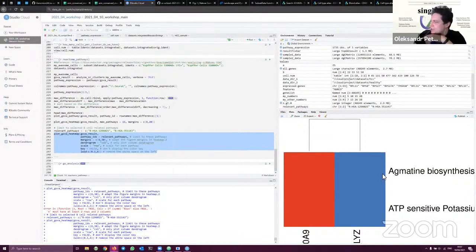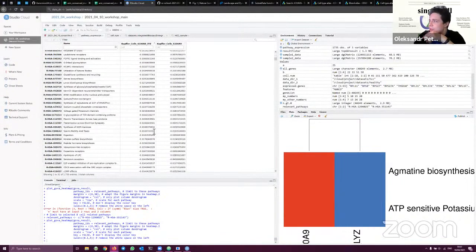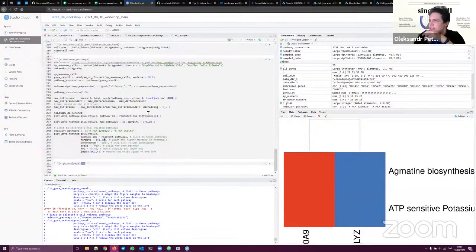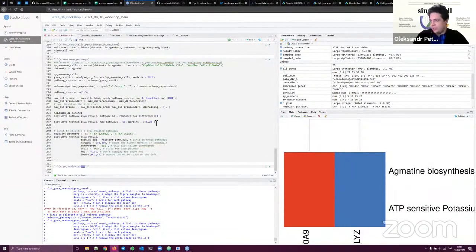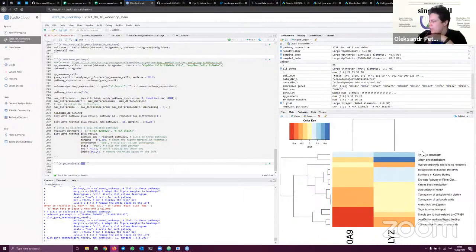However, still, you see, from this example, you again cannot distinguish between these cells. Still, it's not the most optimal way either, because of the sample we use or because of the pathways. So I would say first play around with the most differently expressed pathways which we observe, and then we decide if we would like to compare them with some other pathways.